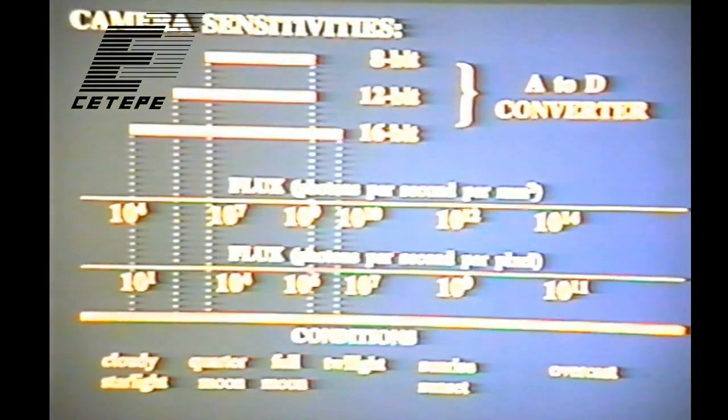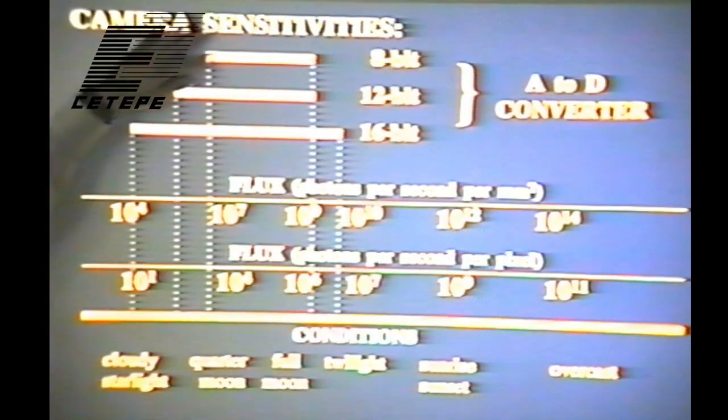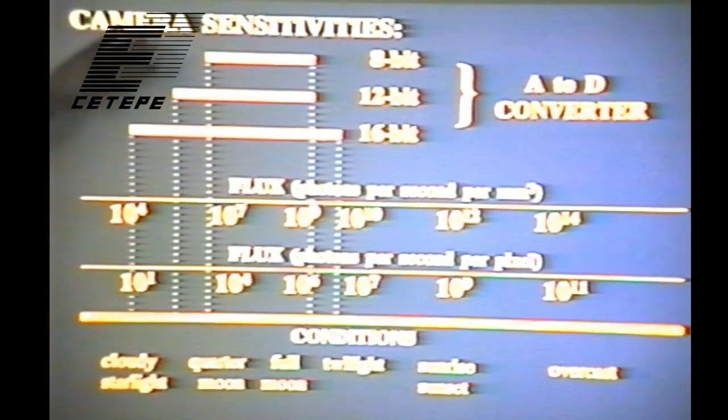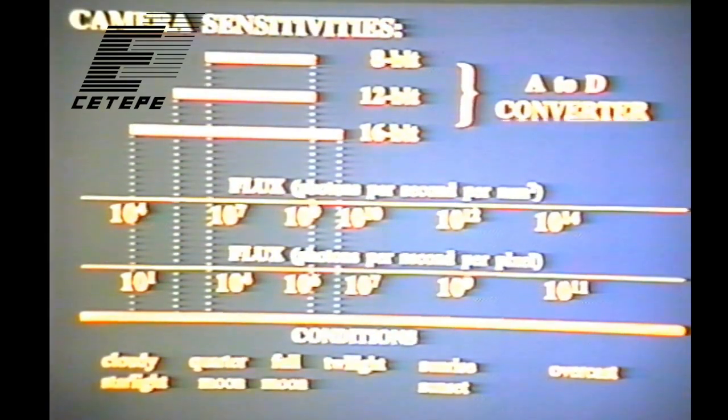So this is kind of a busy slide, but what I'm trying to show is 8-bit cameras, like consumer devices, 12-bit, such as high-end radiology CCD cameras are right now, and 16-bit, which is the maximum you can buy that I know of in terms of these cooled slow scan CCDs. And down here, this really should say fluence.